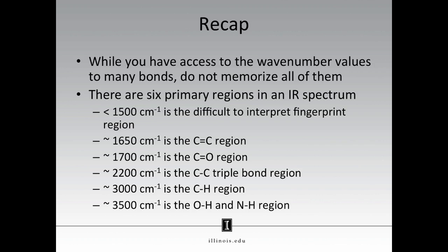In the next webcast, you will see examples of all of these stretches. There, you will see how shape can be used to identify stretches, and you will see examples of how the same type of bond, say carbonyls or CH bonds, can appear in different locations depending on the type of carbonyl or CH bond.